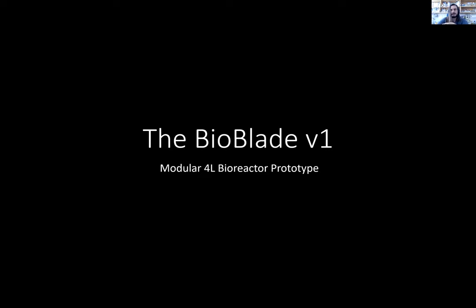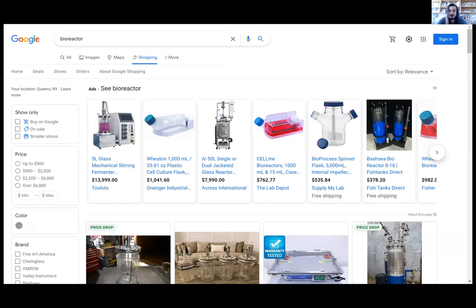Let's see. Okay, and now the last one I want to talk about, and the one that got me all the way here to talk to you guys today, is the BioBlade. So bioreactors, they're expensive. They're so expensive. The consumables for bioreactors are expensive. The little dumb bottles that spin are like $500. Some of the plastic disposable bioreactors are like $700 for like 10 of them or something like that.